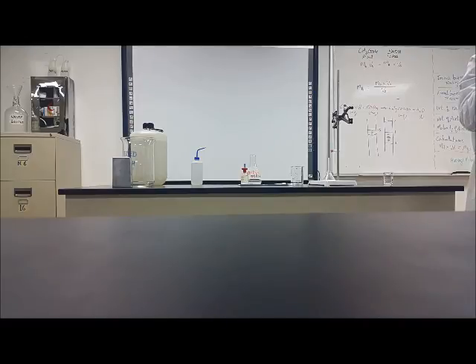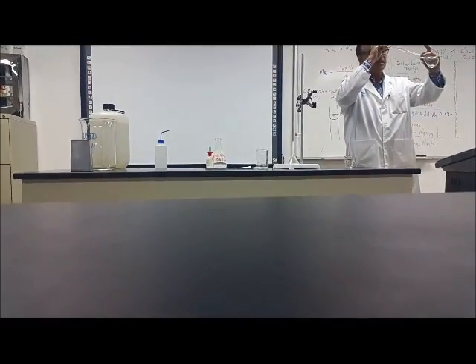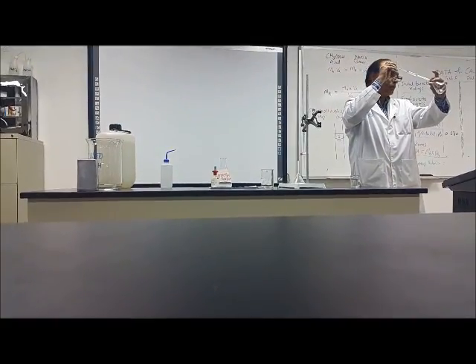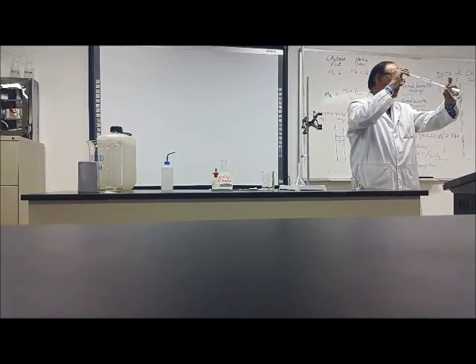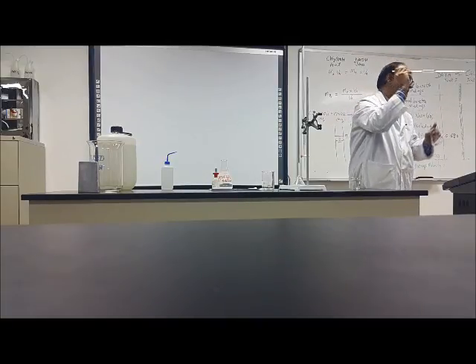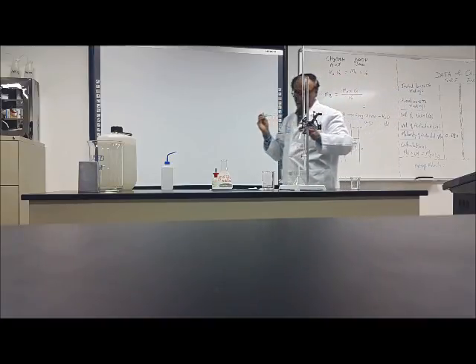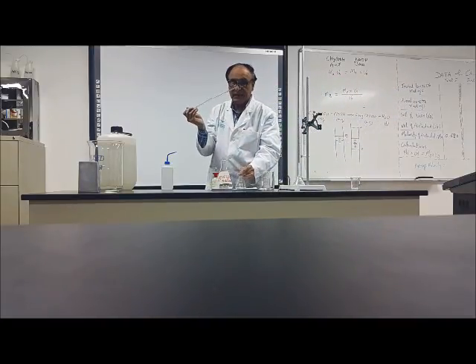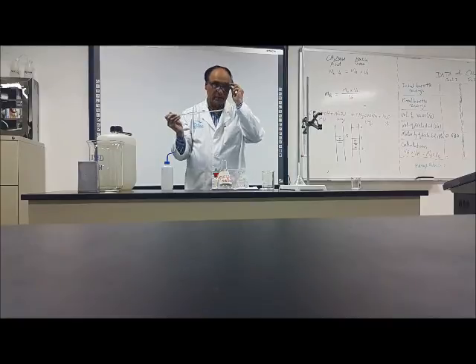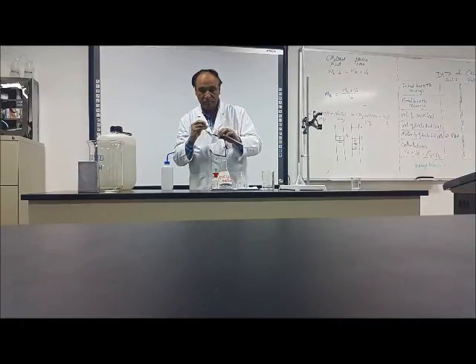And you will not blow it. Don't blow it. When everything is gone, touch it twice, 1, 2, on the empty side. Not here in the solution, on the empty side. So there is a drop there. Don't worry about the drop. This is exactly 10 milli. This has been designed so that 1 drop will remain there. So nothing to worry. We will never blow it.